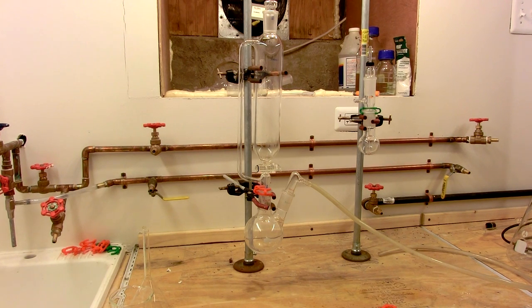Hi everyone, welcome to another Doug's Live video. In this video, I'll be going over the basics of a chlorine generator, as well as some tips and tricks on drying gases.